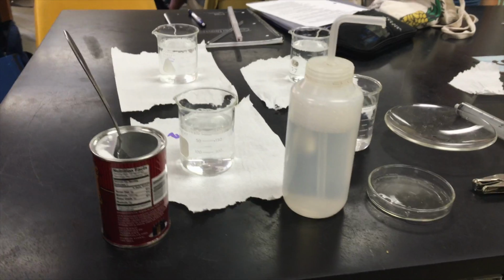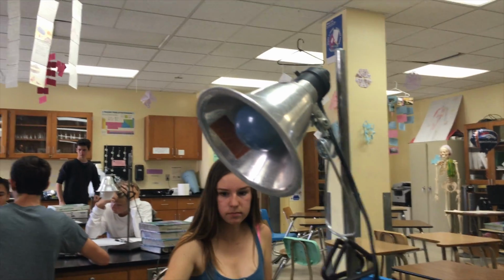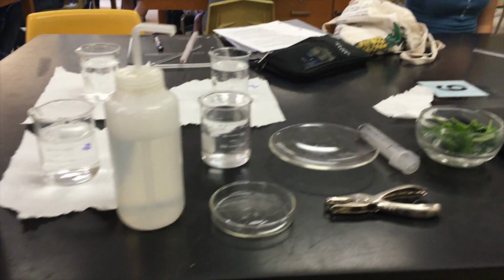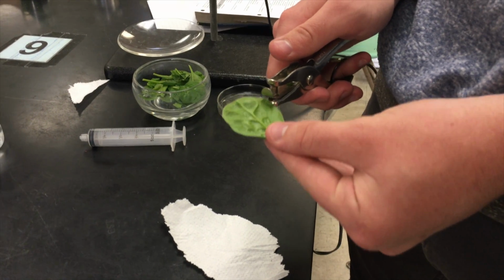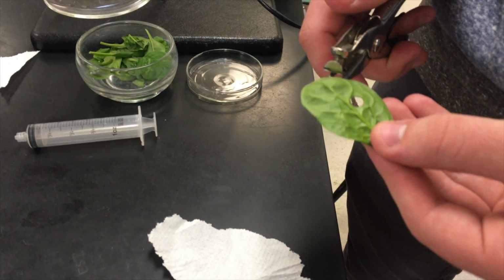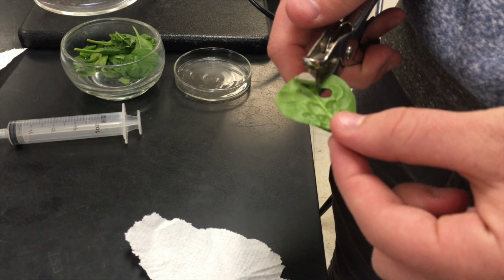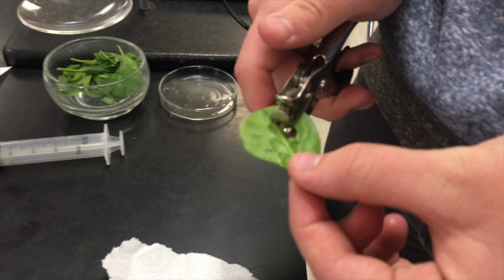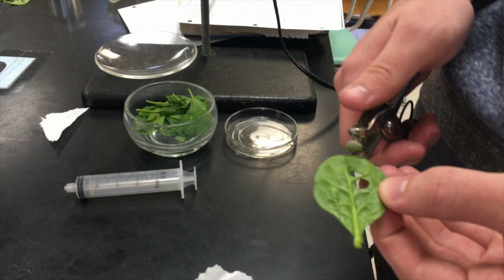Necessary materials include sodium bicarbonate, which is just baking soda, liquid soap, plastic syringe, leaf material, a hole punch, plastic cups, a timer, and a light source. Our independent variable will be the bicarbonate concentration, and our dependent variable will be the number of discs floating after a minute. Control variables include the size of the leaf discs, or the amount of time a cup is under the light bulb, etc.